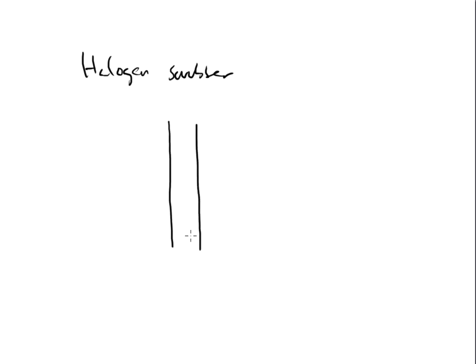Okay, so here's the scrubber, and in our instrument, I believe that our arrow points up, just like this, and my flow rate comes in from the bottom, and it comes out of the top. So over time, what will happen is that my sample will go into this halogen scrubber, and this halogen scrubber is going to go through some copper mesh, right? And that copper is going to be like a shiny copper penny. It's going to be very shiny. It will be very bright.